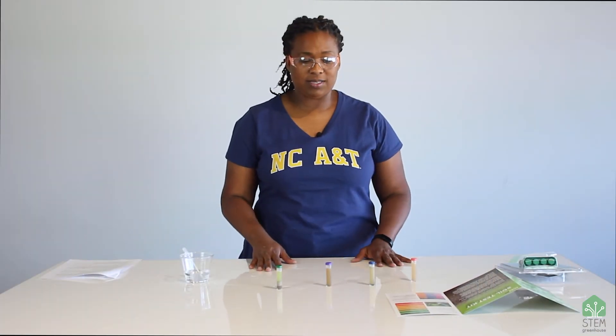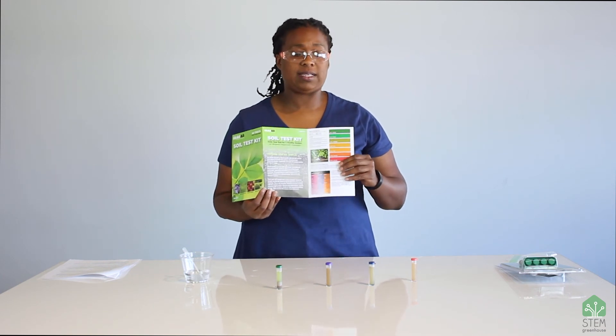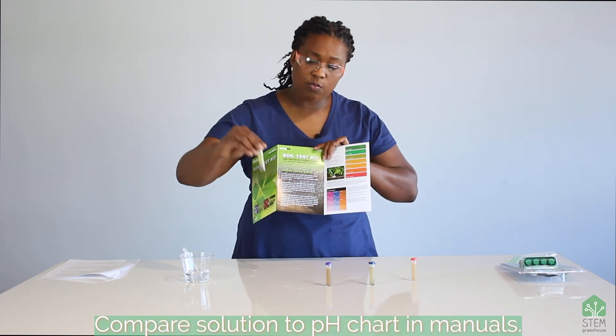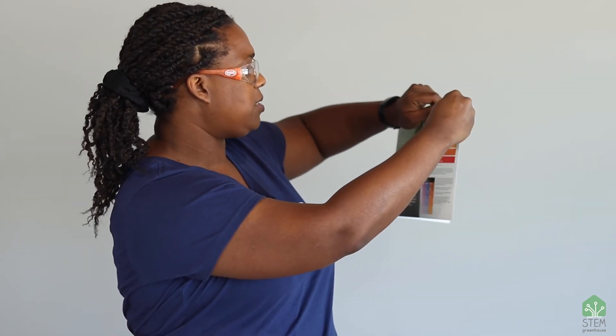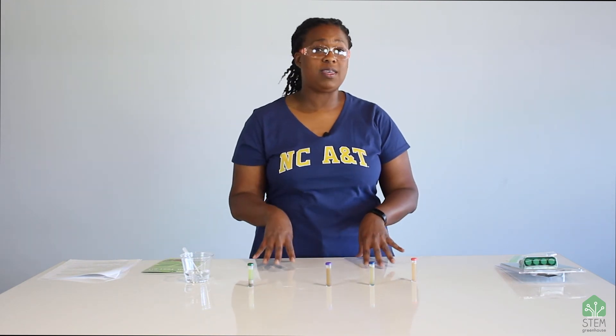After 10 minutes, you're going to use the instruction manual that comes with your test kit to compare the color of your test to the colors on the plant food chart. You're going to do the same thing with the pH. For example, you look at the color of the indicator for pH, compare it to the different colors on the chart, and you might say this looks closest to a pH of 6.5, which means it's slightly acidic. That's how you measure your soil chemistry.